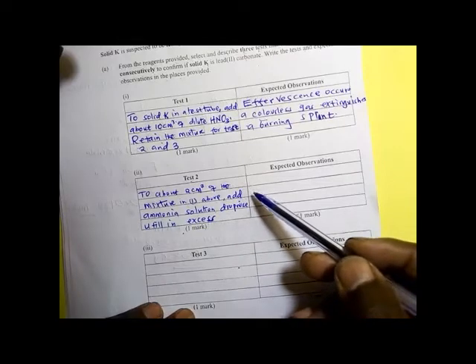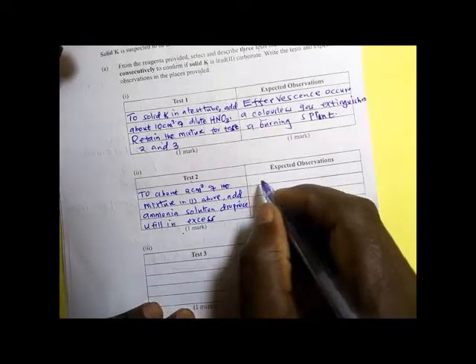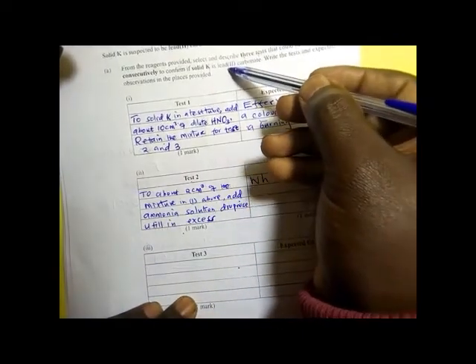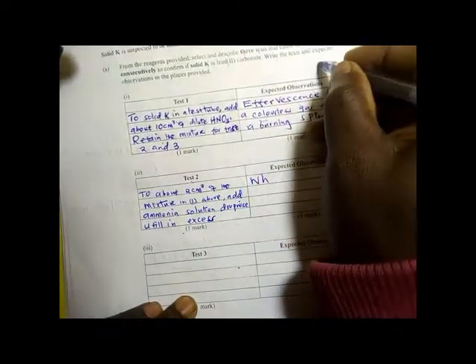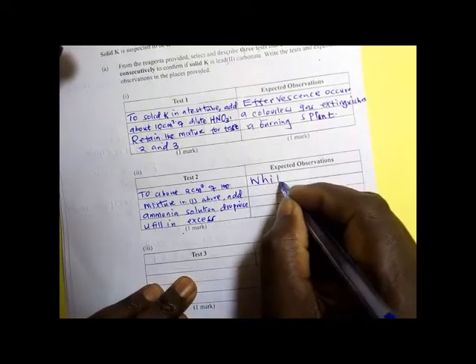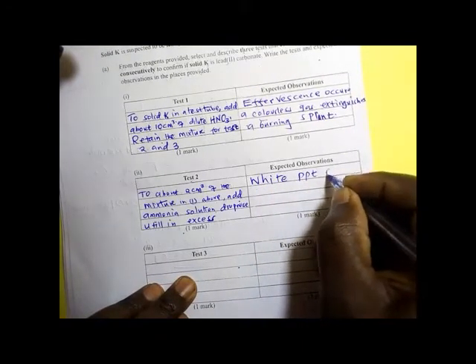So here the observation is that a white precipitate is formed, insoluble in excess, because we are suspecting lead.